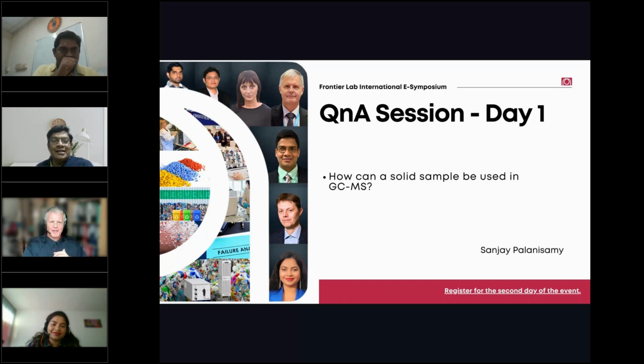That is the purpose of the PY system, because if you do not have a pyrolyzer, you cannot do solid samples. You can do it usually with headspace. Even if you have a TD system, you can also introduce solid samples. But headspace and TD systems can take you only to a certain temperature, like 350. But when you really want to heat above 350 for a sample like polymer, then you really need a pyrolyzer.